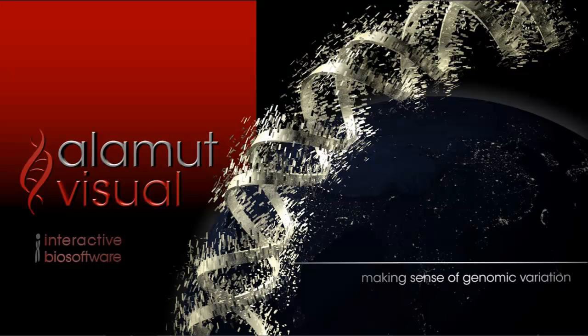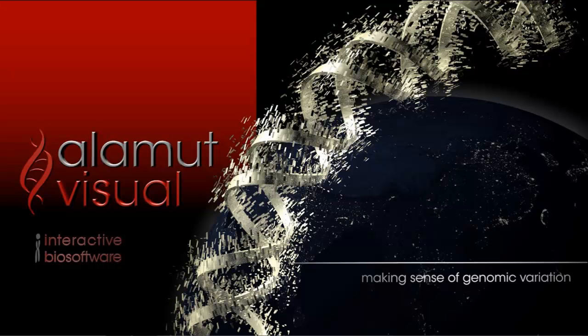Today, Alamut Visual includes more than 23,000 protein coding genes, non-protein coding genes, and pseudogenes which are frequently updated. Gene information is gathered from different public databases like NCBI, UCSC, and EBI.